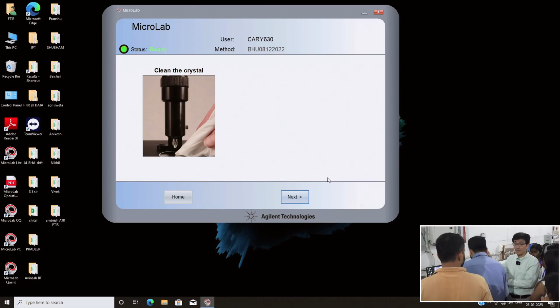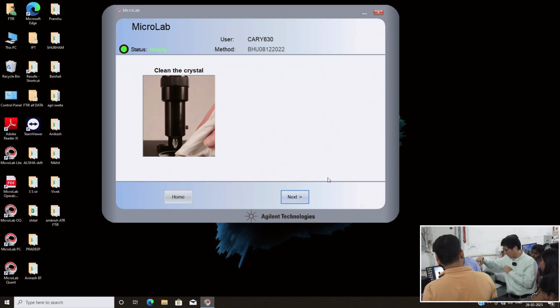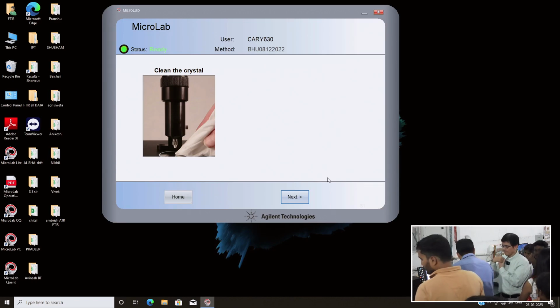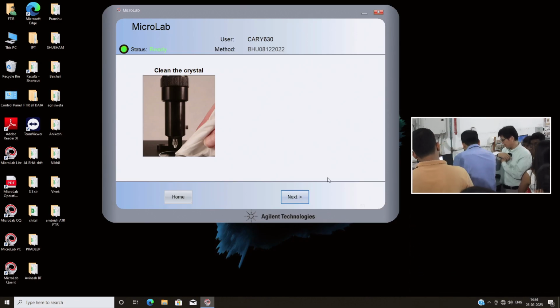So already I0 is air. So let's share between two measurements. I0 is air. I is solvent or solution. So replace the sample with sucrose in higher concentration. Higher concentration. Yes.